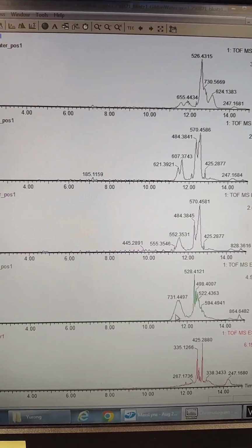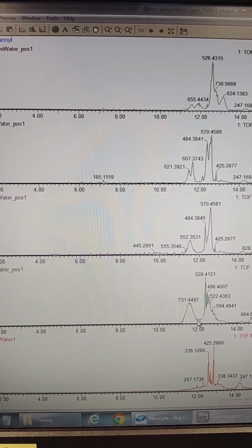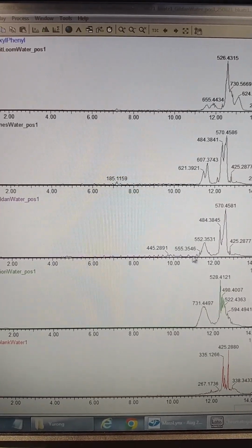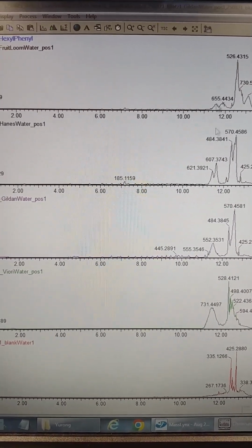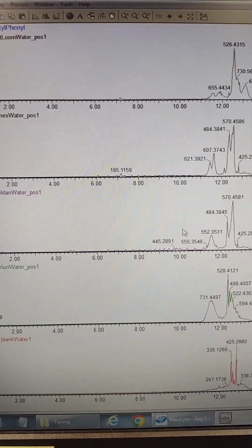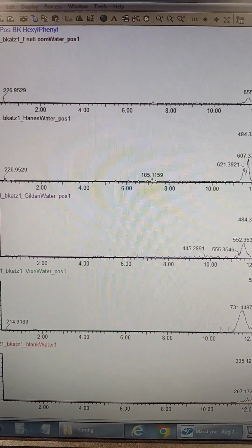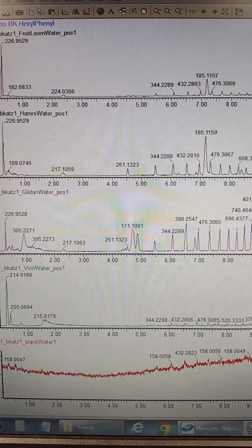So then we have this kind of big blob out here. That's only really looking like it's in the Viori shirt. Maybe it's kind of carrying over through all the other samples. Maybe I dirtied it up. We ran the Viori first. But the interesting thing is, let's look at the more polar stuff. Since we've extracted with water, the early stuff.